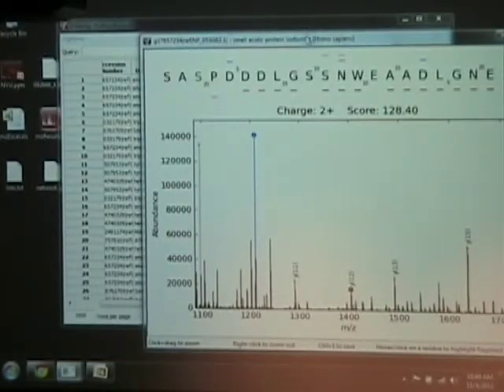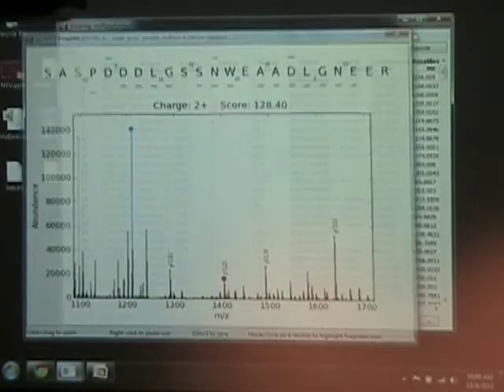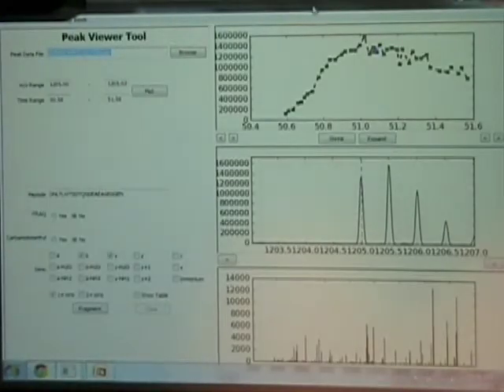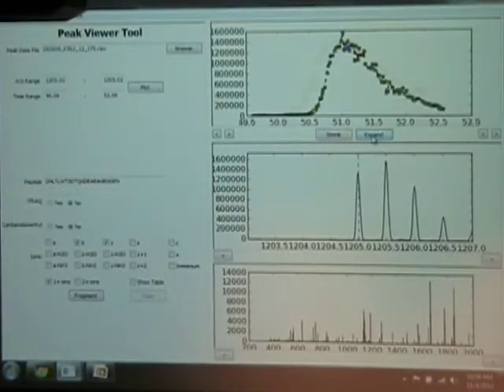I'll show you later. I have a PDF that I just made of this. I don't want to waste time on that. So this is a more interactive way to share data. It also allows you, let me show you, if, let's say you have the data lying around, so I have one of the raw files, so you're in the sort of rare situation where you could actually get the raw data underlying the publication. If you double click on that row, the tool will then launch an interactive display that's actually hitting the raw file, and now you're really getting more data.